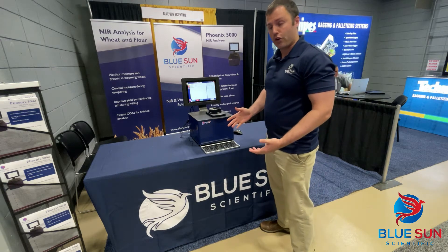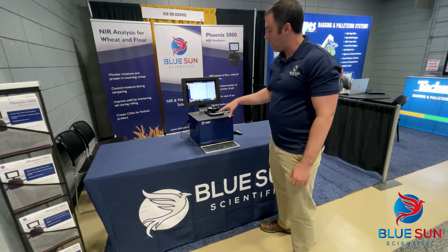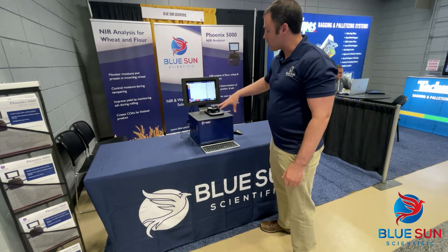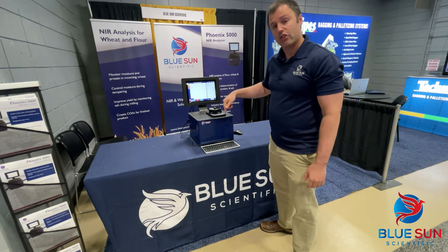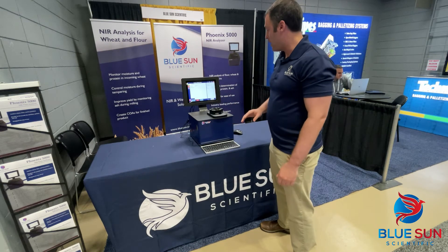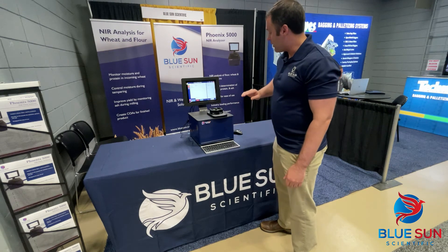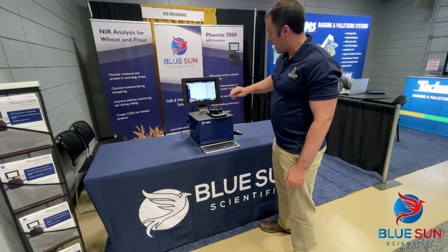Standard analysis takes about 30 seconds. You can see the sample car moving into position. With this design, we're actually able to scan centric circles from the sample cup, which allows us to scan 100% of the sample cup. This is a big improvement over previous generations. The sample cup will move into position and index again.